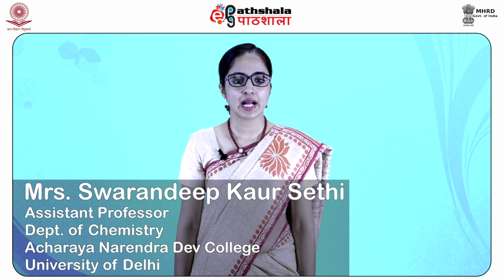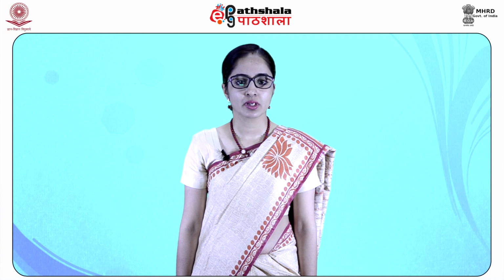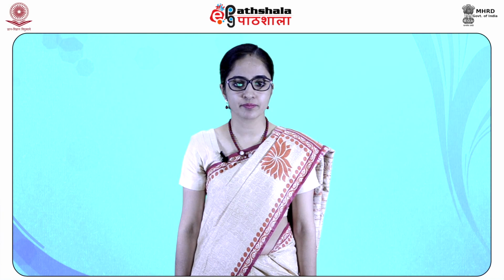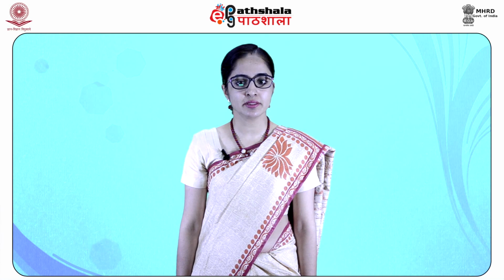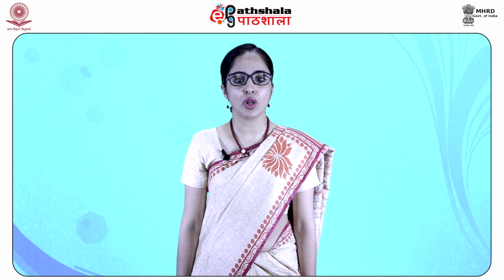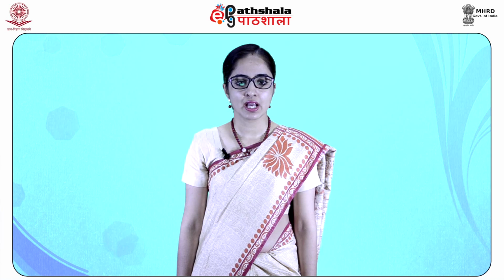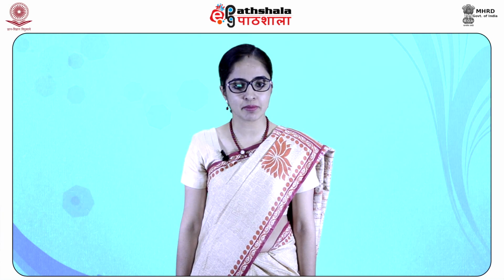Dear students, after studying this module, you shall be able to understand the consideration of various NMR instruments, know about the components of an NMR instrument, NMR spectrometer and modern NMR instruments. Know about the sample handling, locking, shimming and temperature regulation. Understand the basic data acquisition parameters in an NMR machine.